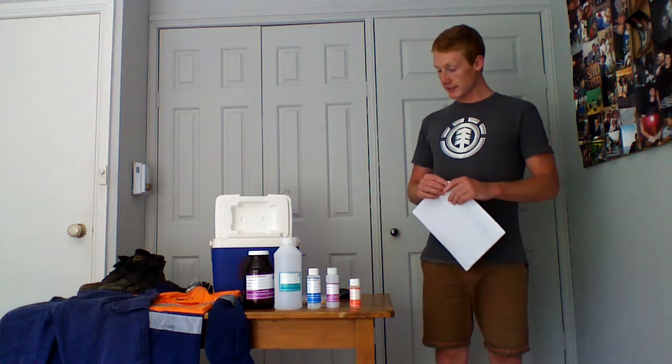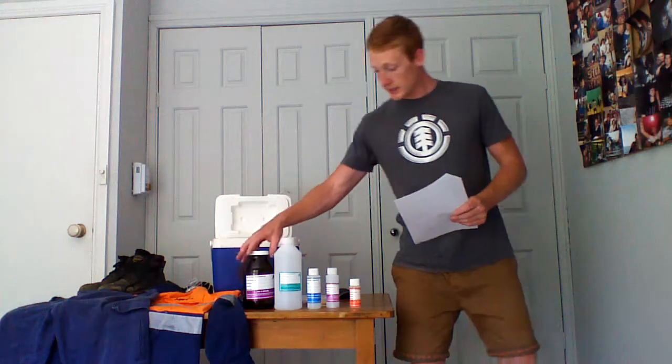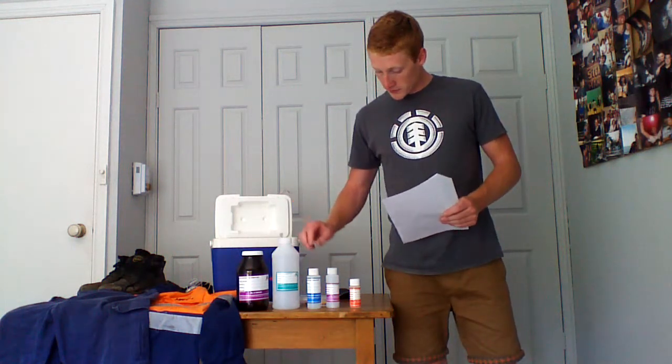Sample container selection. I've got a few different sample containers here provided by ALS. The preservation of a sample is highly dependent on the selection of sampling container. Some containers may contain chemical preservatives designed to prevent reduction or loss of the target analytes through physical, biological or chemical processes such as precipitation, adsorption or oxidation.